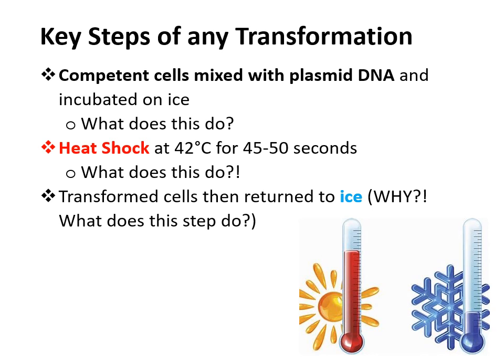What you then would do is you would take that sample and you would put it into a hot water bath. I know, sounds relaxing. You would put it in the hot water bath as a heat shock step. And you only do that for 45 to 50 seconds. Each protocol varies. Some of them are up to 90 seconds. Either way, it's not very long. It's about a minute that you keep it in 42 degrees Celsius.